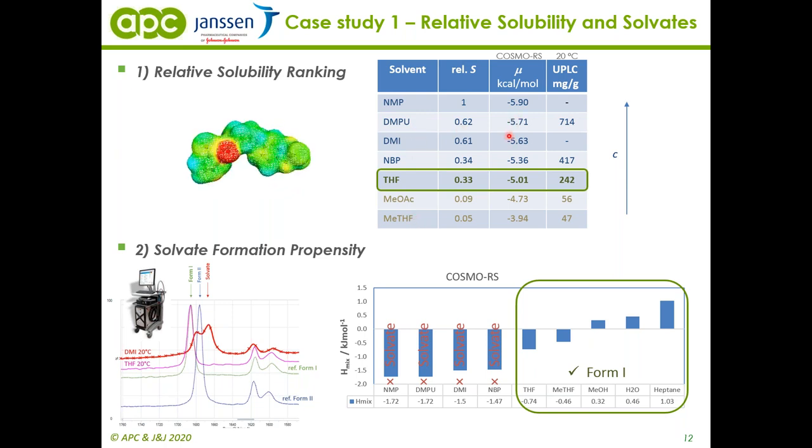So we computed the relative solubility based on solvation free energy, using a non-iterative method. Here the solvents are ranked in the same order as we can see in the experiment.